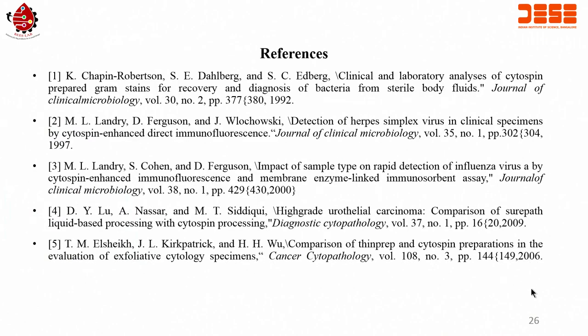So please use this slide as a reference, and you can read the papers so you know more about the importance of the cytospin in cytology based screening. All right, this is the end of this particular module, and that's why I want to show you two videos, which you will see as a part of understanding the cytospin and spin coater in detail. I'll show you how the spin coating is done and how we can use cytospin in reality.